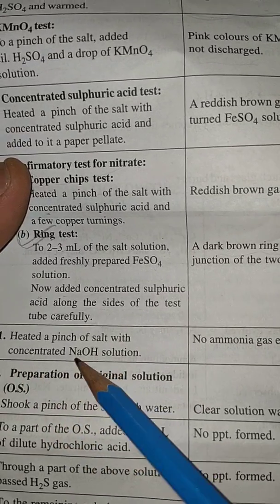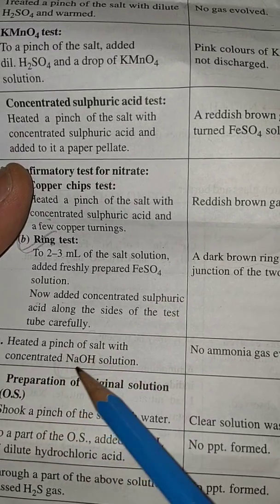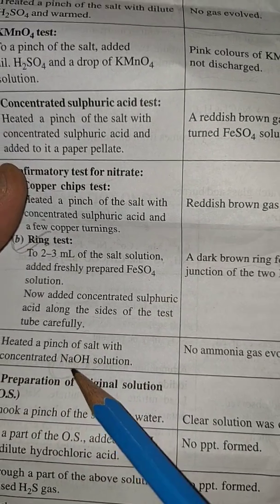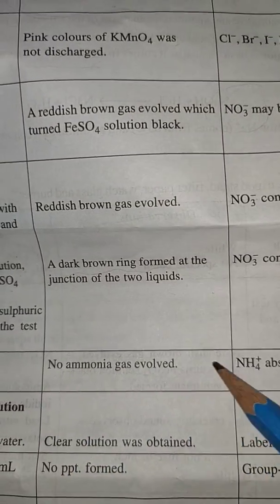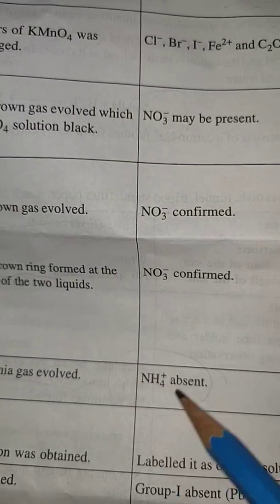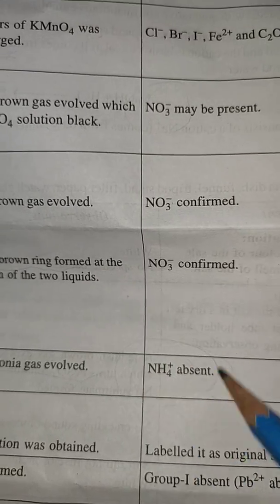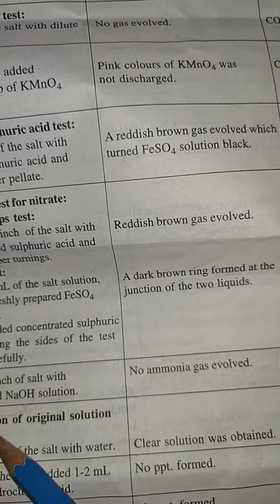Now heat a pinch of the salt with concentrated base, that is highly concentrated NaOH strong base solution. No ammonia gas evolved, that means ammonia is absent, that is ammonium ion is absent.